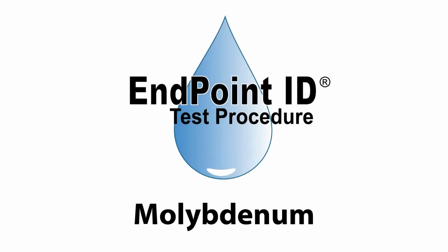This is a demonstration of a molybdenum drop count test kit using endpoint ID procedures.